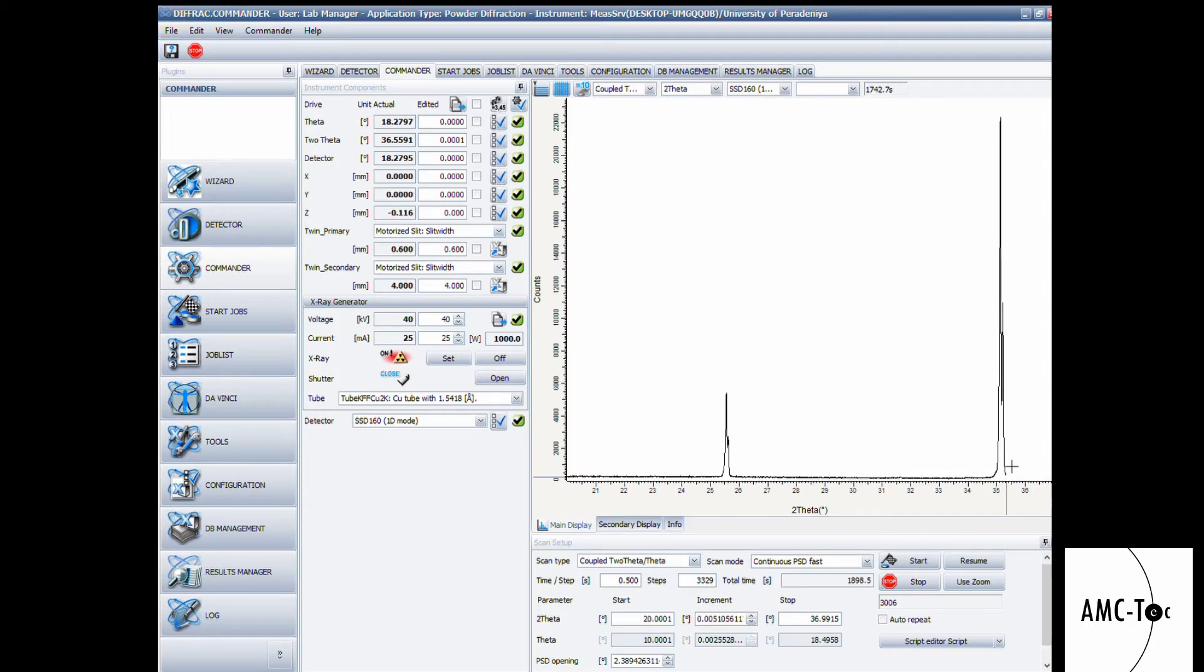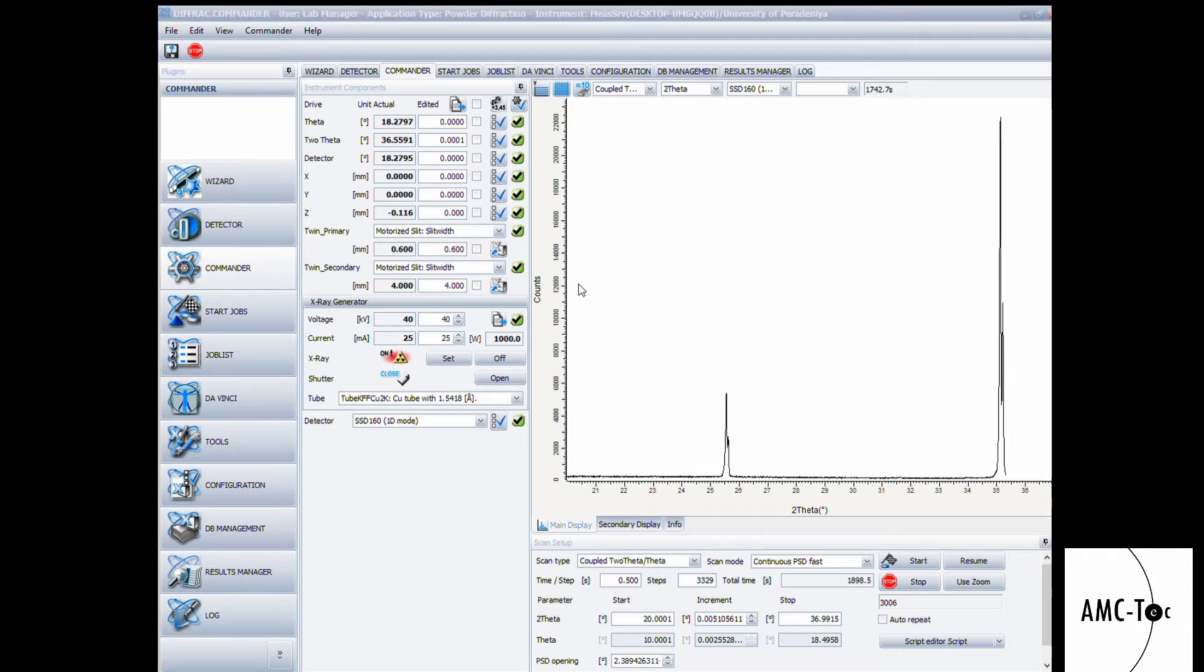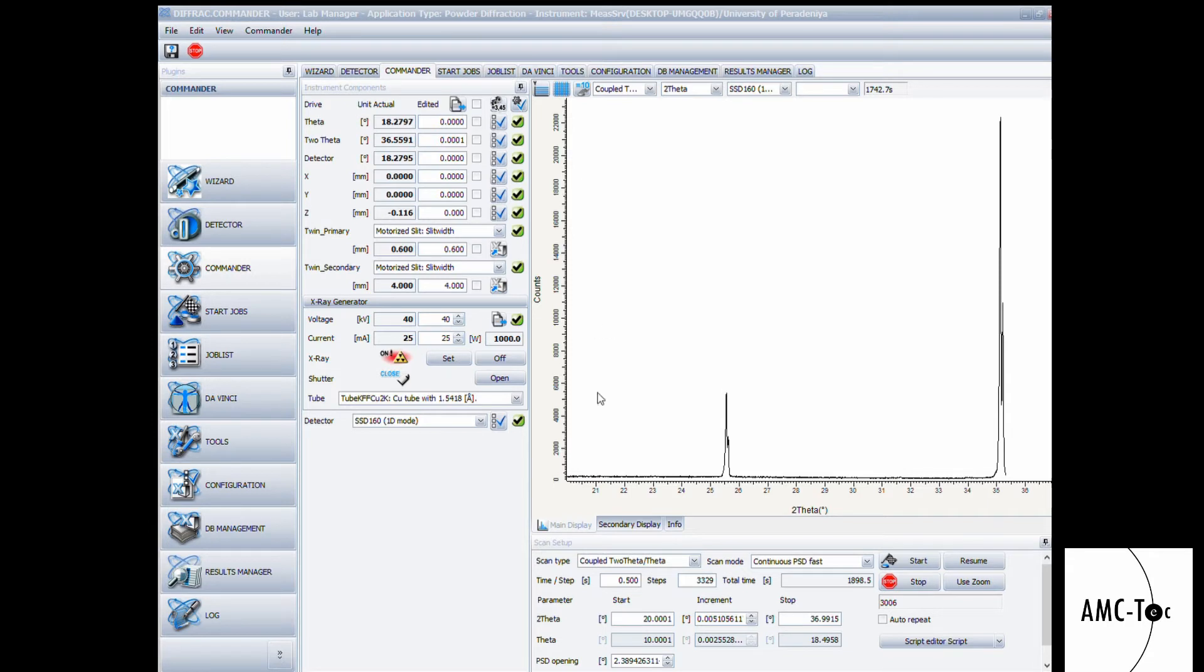This is the obtained diffractogram for the standard corundum calibration sample. Now we can do a peak fitting and check whether the peaks are shifted or not. If the peaks shifted, then we have to do a detector calibration. But for the purpose of this video, we will do a detector calibration even if it's not shifted.